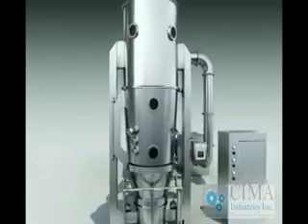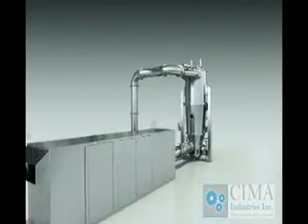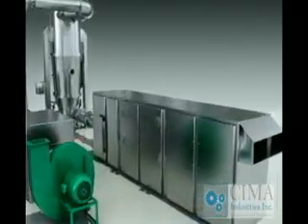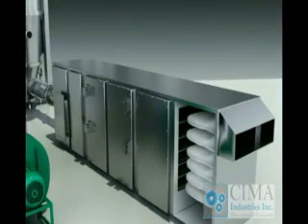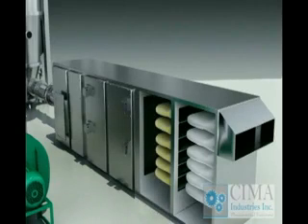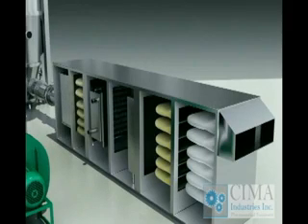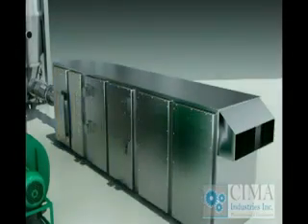Air inlet system. The air inlet opening is normally in the auxiliary machine room or outdoors. The air inlet system, also known as the air inlet handler, normally consists of pre-filter, post-filter, steam heat exchanger, sub-high efficiency filter, and/or HEPA filter. Dehumidifier with preheating arrangements and air inlet bypass of heat exchanger are available on request.